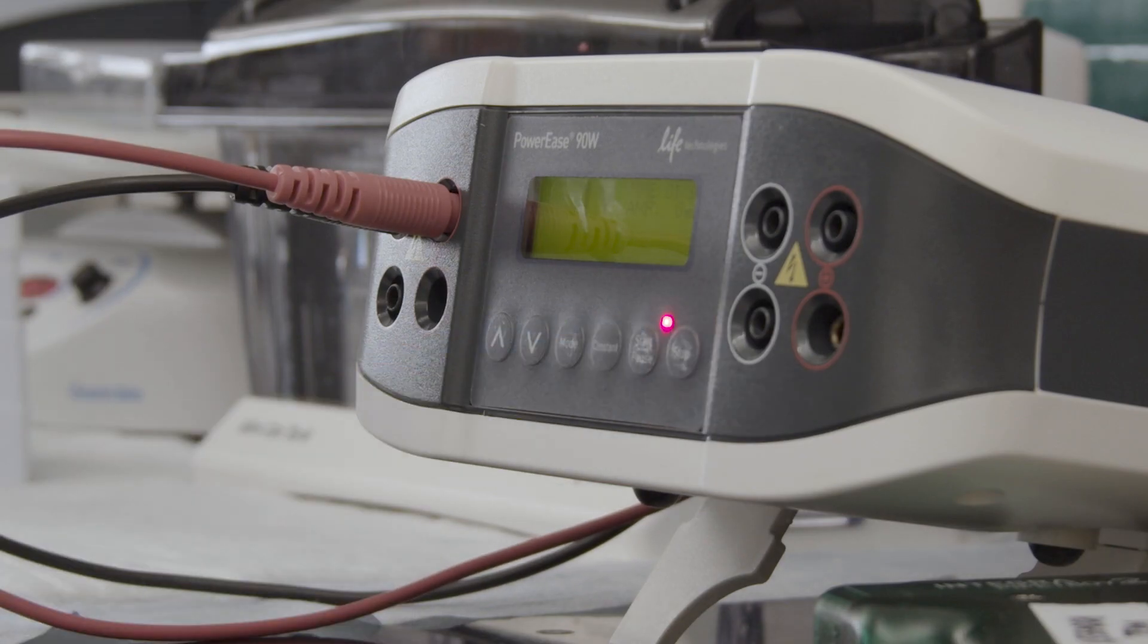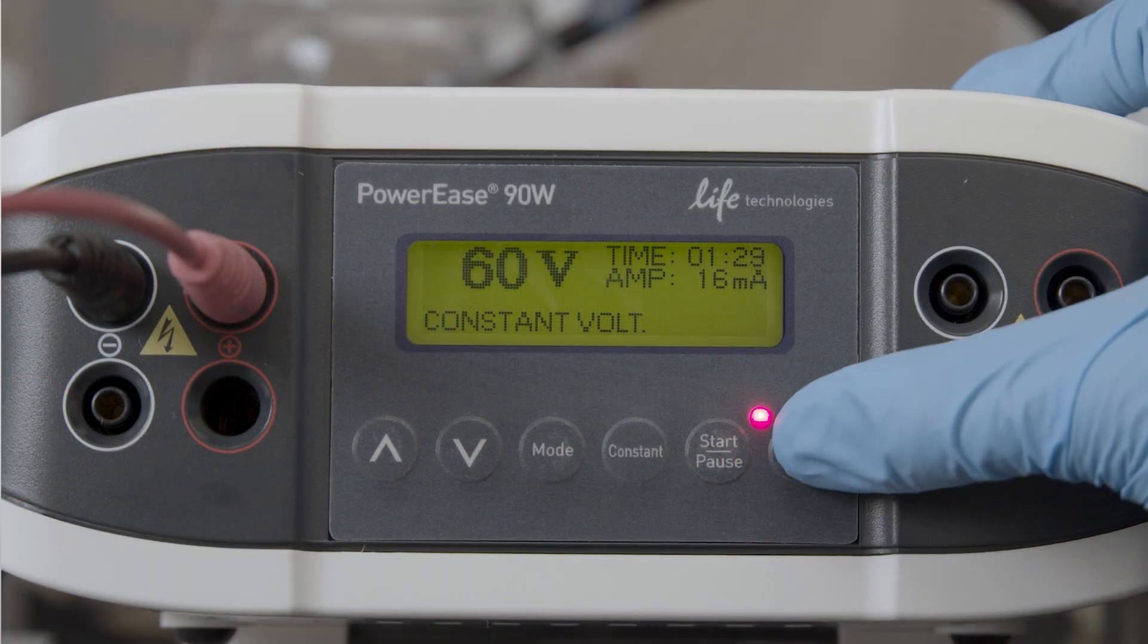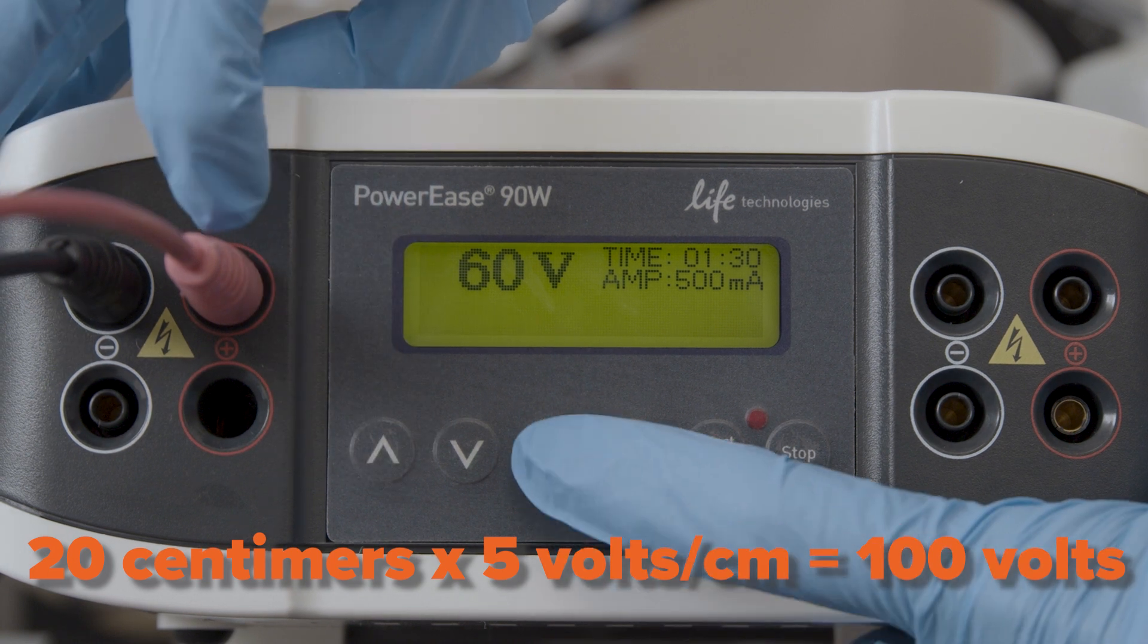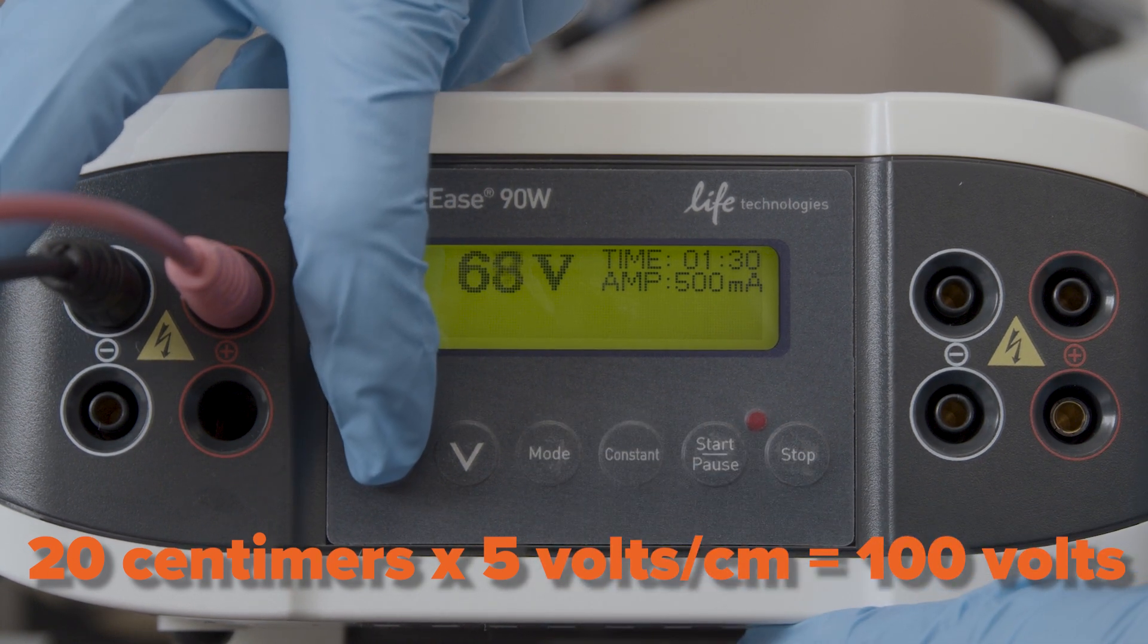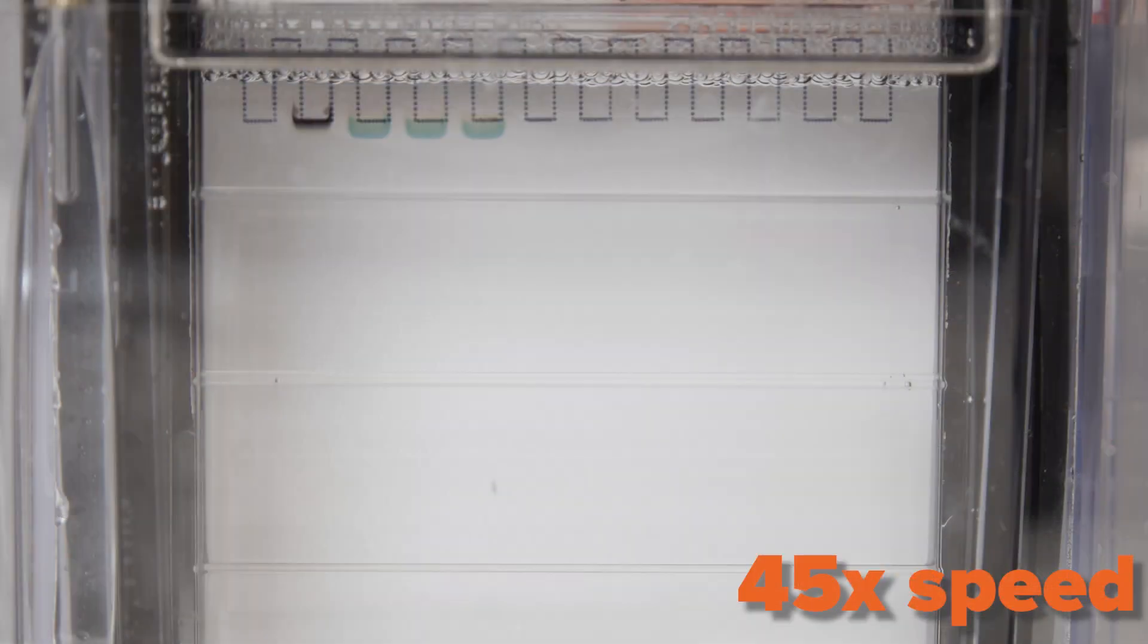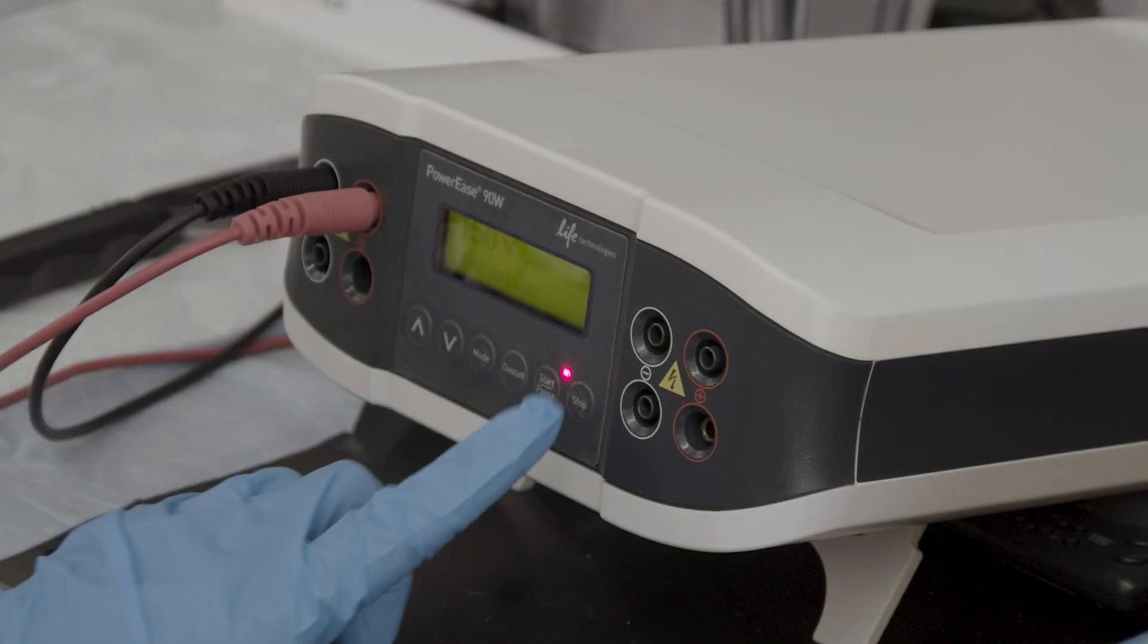Run the gel at a low voltage, usually 50 to 60 volts, for 30 minutes. This allows the samples to line up and enter into the resolving gel. After 30 minutes, increase the voltage to a final voltage of 5 to 15 volts per centimeter of gel. The pre-stained protein standard will be visible on the gel as it runs. Watch it closely and do not run your protein off the gel. When the protein standard has separated to the desired degree, one that will allow you to get good visualization of your protein, turn off power to the gel.